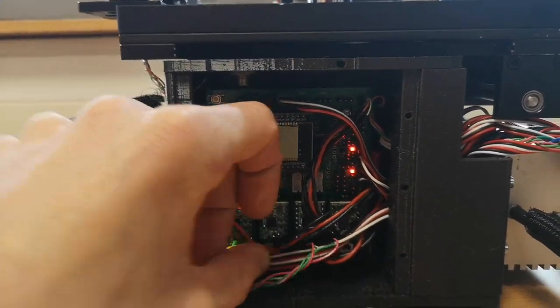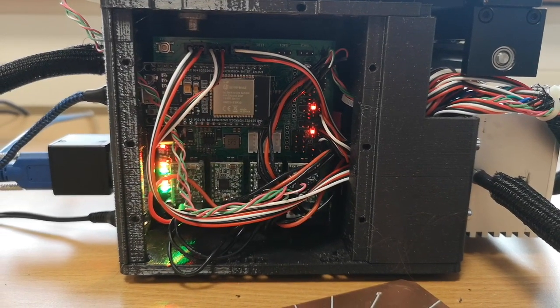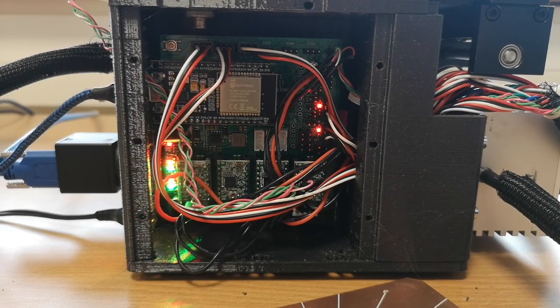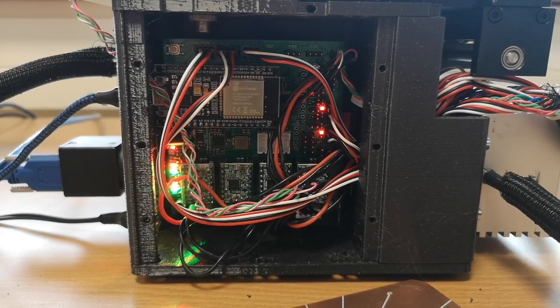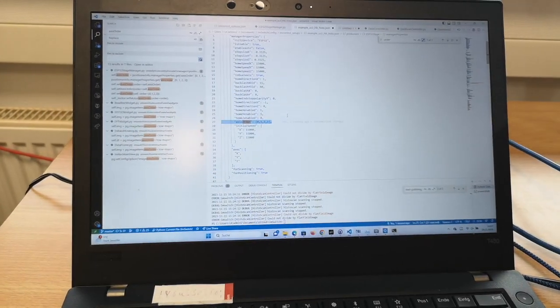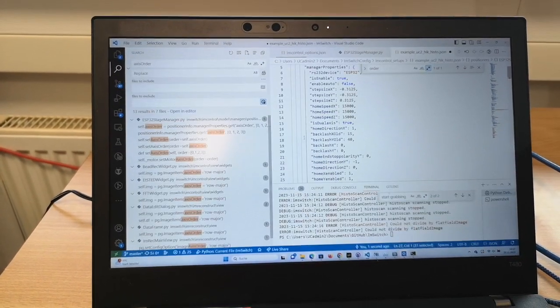However, you can also change that in the code, in the JSON of the ImSwitch, both the direction of travel and also the axis assignment. So I'll show that in the docs. To complete the picture, I want to demonstrate how you can swap the axis in the code.